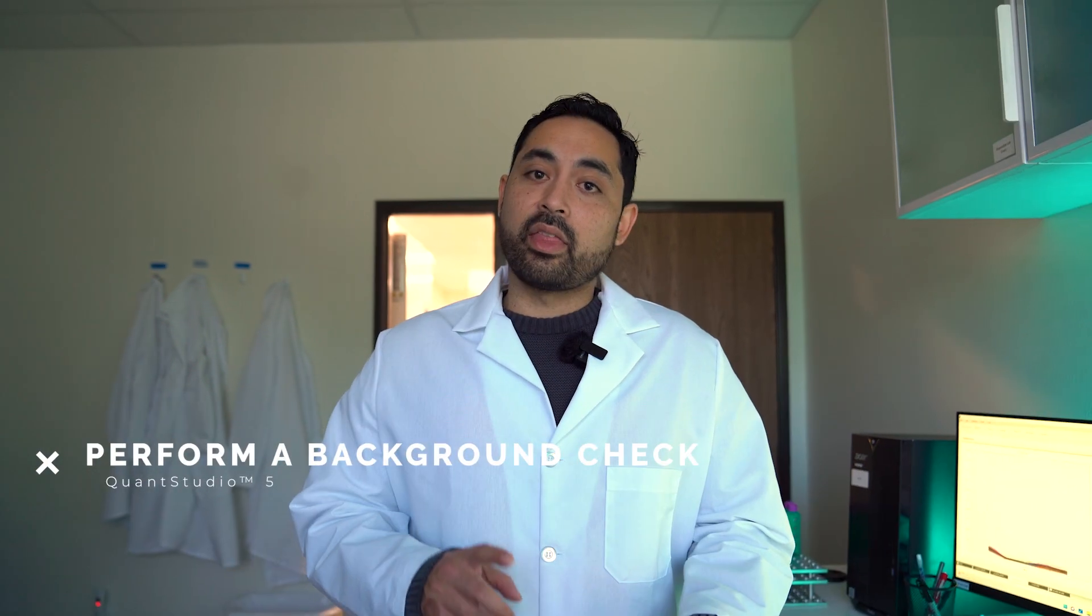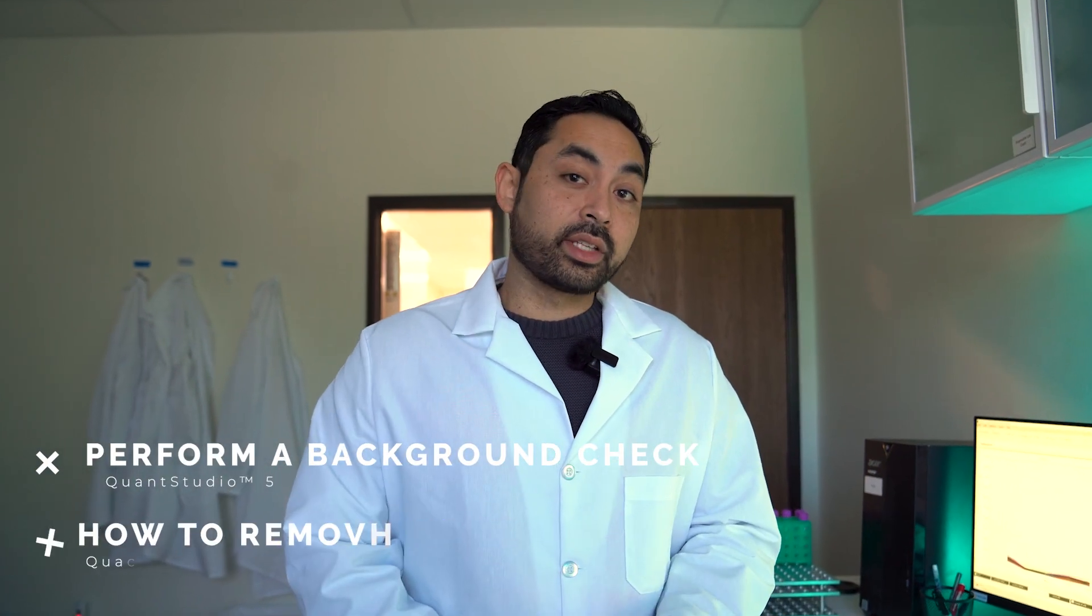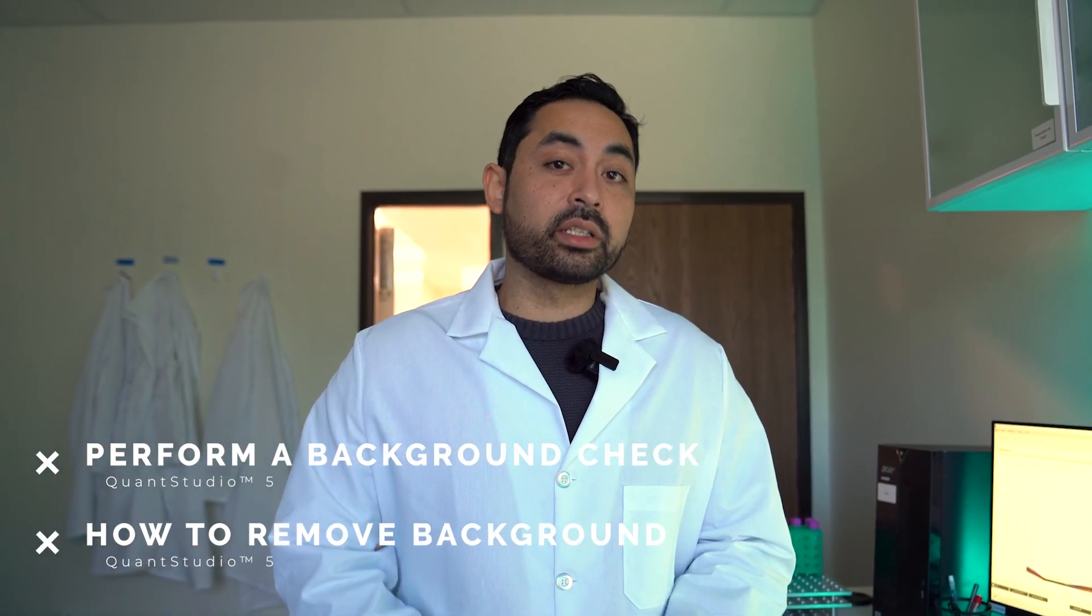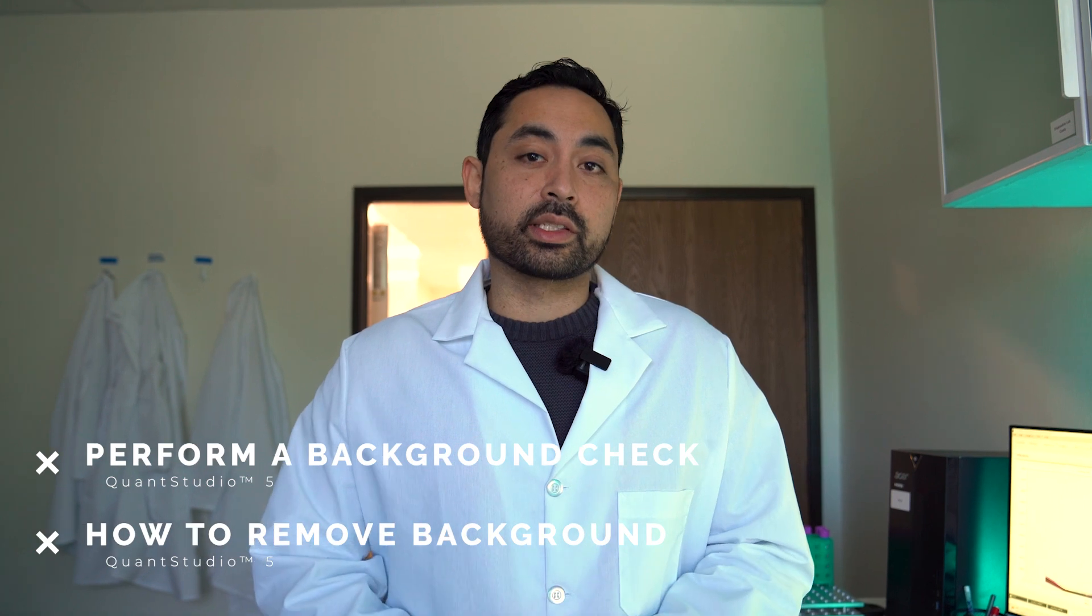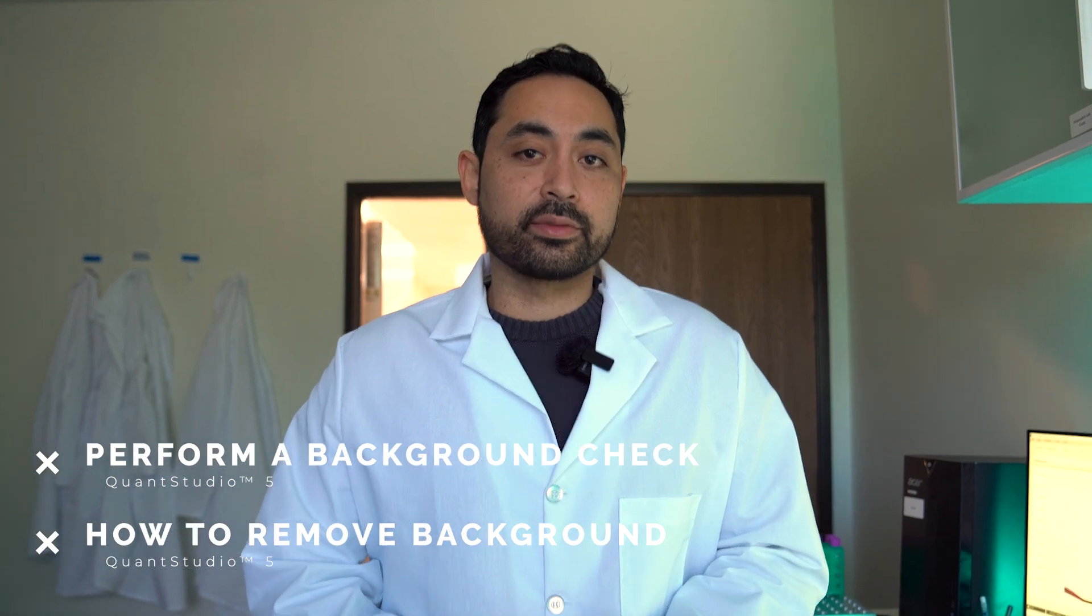So in this video, I'm going to show you how to do a background check and then how to take care of your instrument if you do notice high background.